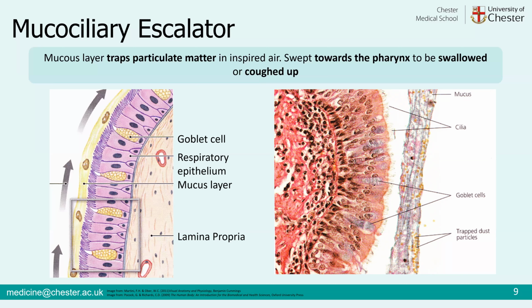Sometimes when we prepare tissues for histological viewing, we have to process it, we have to take it through different chemical solutions, we have to stain it. It introduces what's known as artifacts. That is, the tissue ends up not quite appearing the way it does in life, in our bodies. So the artifact that tends to be introduced here is this gap. So you can just about make out the cilia here, the little fringe-like cilia, but the mucus is all the way over there.